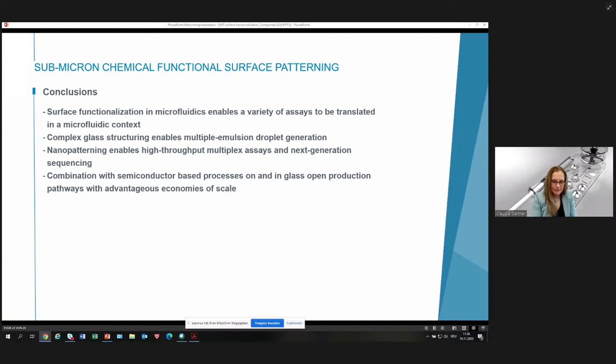Now, if we are talking about binding cells on a microscope slide or in a rough channel, this is much more economical because we're using classical lithography. And then we can talk about flow cells going in the few decades of Swiss francs or dollars or euros. That would be 50, 60, 70, depending, of course, on the volume, right? But yeah, it's not prohibitively expensive to do a good silanization, provided you know how to do that.